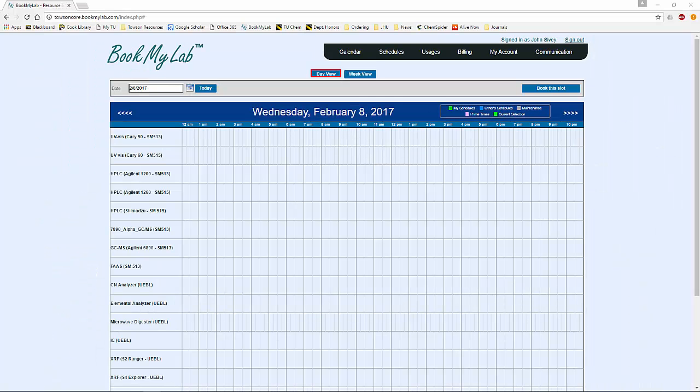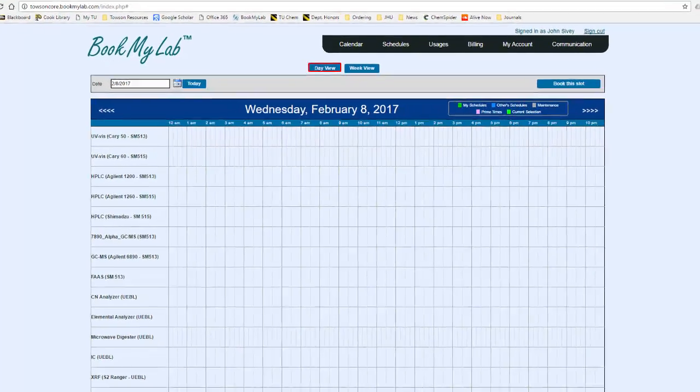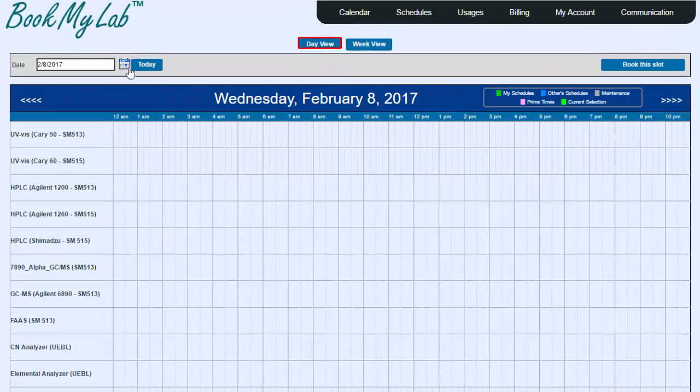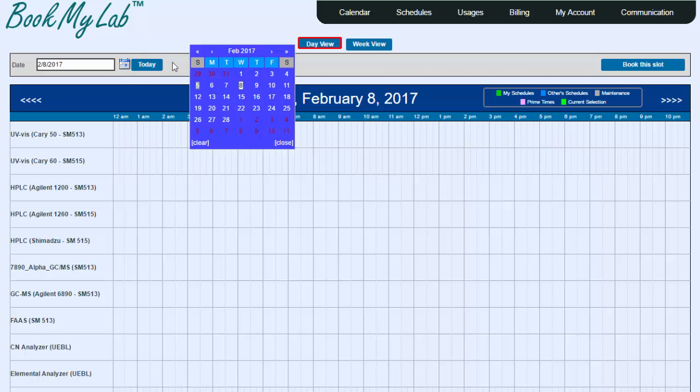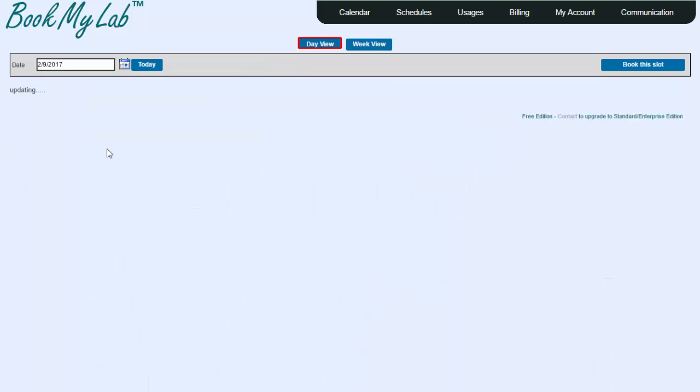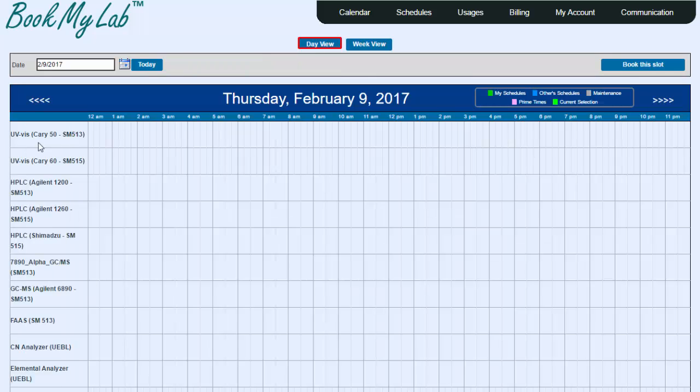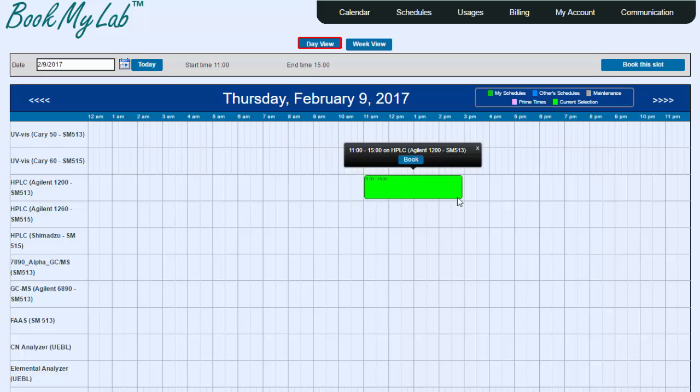After you log in to BookMyLab, you'll come to a page that looks like this. You can select the date in which you want to make a reservation by clicking on the calendar and then selecting the appropriate date. On the left hand side is a list of all of the instruments. If for example you wanted to reserve the HPLC Agilent 1200 model in Smith 513 on Thursday February 9th from 11am until 3pm, you can simply click on the appropriate time and select Book.